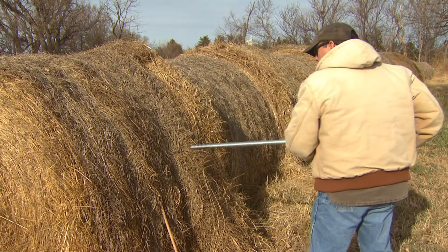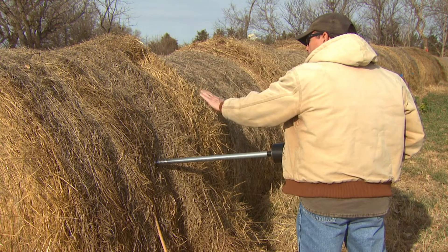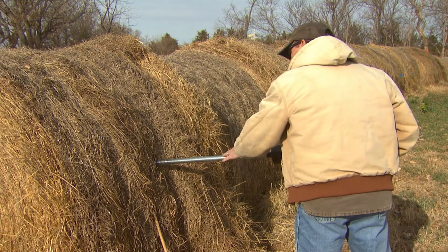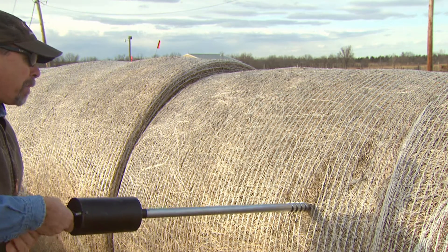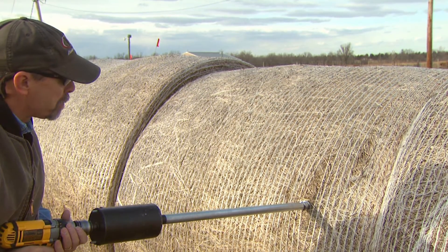For big round bales, core sample the wrapped side of the bale by placing the probe at about the midpoint as determined by height and length of the bale. Hold the forage sampling device at about a 90-degree angle to the bale. If the bale is net wrapped, break the net wrap in the area the probe will penetrate so the plastic wrap is not part of the sample and does not coil around the end of the probe.